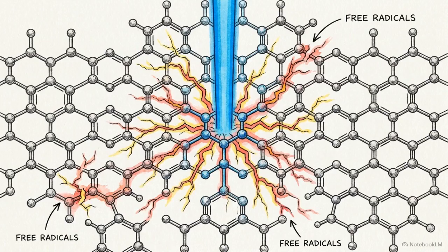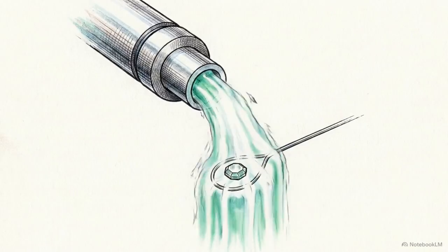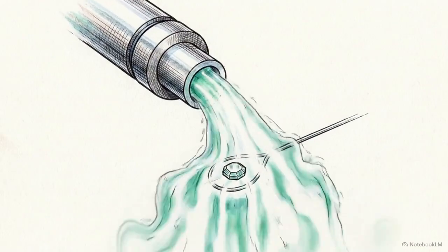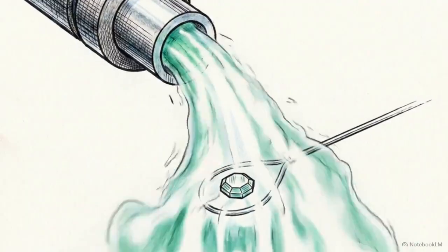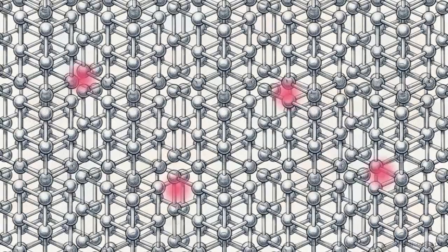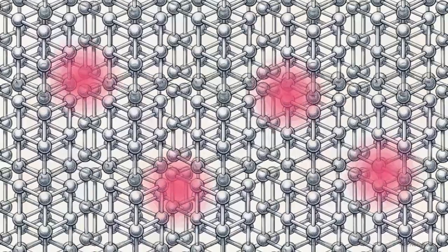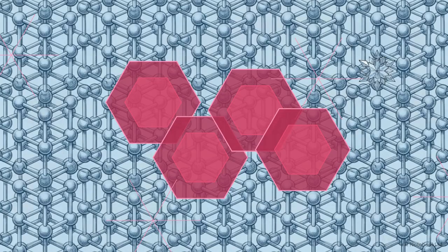However, the intense ionizing nature of the beam rapidly generates free radicals within the crystal. At room temperature, these radicals would quickly diffuse and destroy the fragile biological lattice. To counteract this, a cryocooler nozzle is positioned immediately over the crystal, continuously bathing the sample in a stream of near-liquid nitrogen gas. Cryogenic cooling is a mandatory thermodynamic intervention. Freezing the radical diffusion allows the lattice to survive long enough to yield a complete high-resolution dataset.